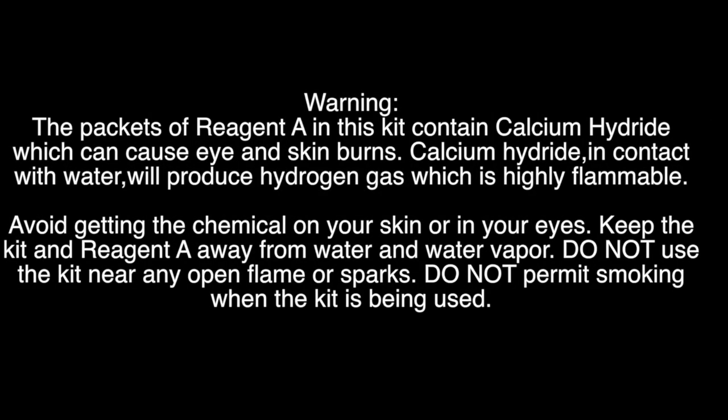Warning: The packets of reagent A in this kit contain calcium hydride, which can cause eye and skin burns. Calcium hydride in contact with water will produce hydrogen gas, which is highly flammable. Avoid getting the chemical on your skin or in your eyes. Keep the kit and reagent A away from water and water vapor. Do not use the kit near any open flame or sparks. Do not permit smoking when the kit is being used.